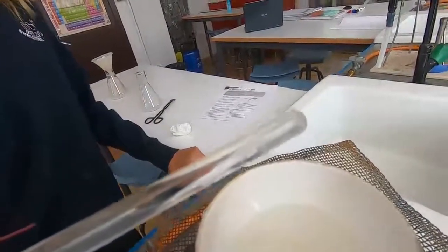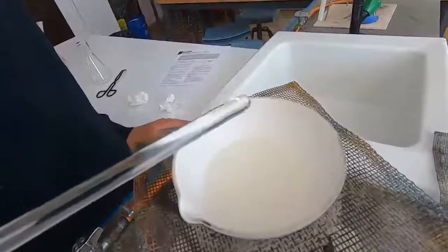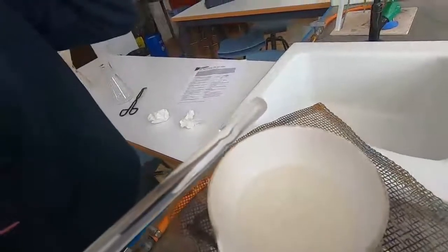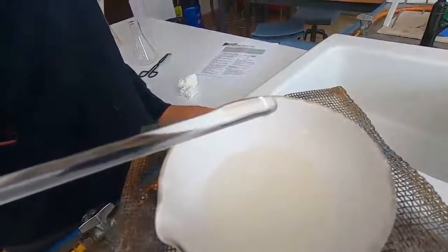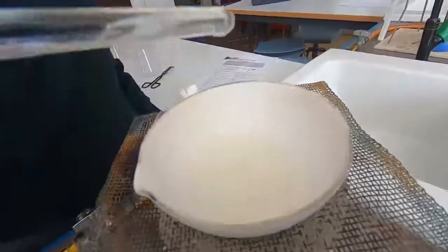At that point we've reached crystallization point and we can turn the Bunsen off and allow it to crystallize. Once they start to form, the crystals start to form fairly quickly, so we'll turn the Bunsen burner off. You can see it's now clouding over very quickly, so we're quite happy with that now and we're going to turn the Bunsen burner off and allow it to cool.